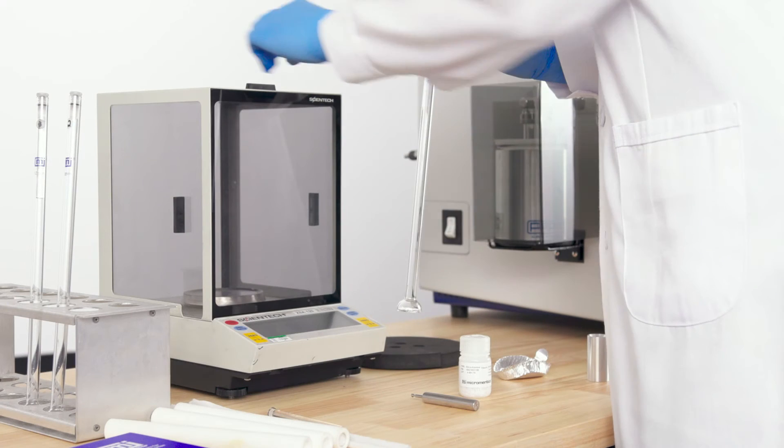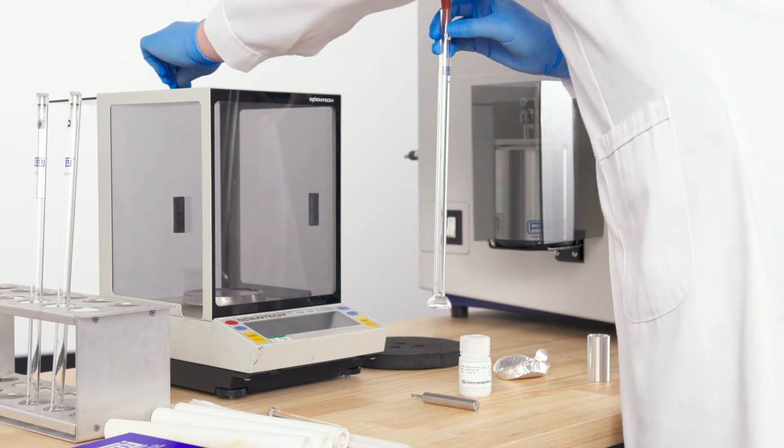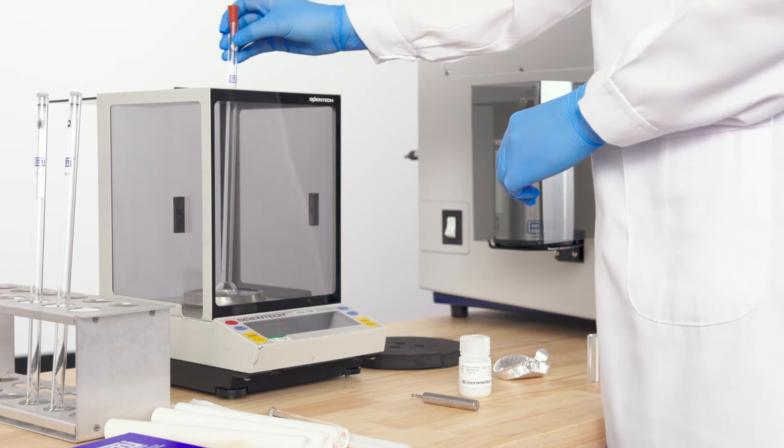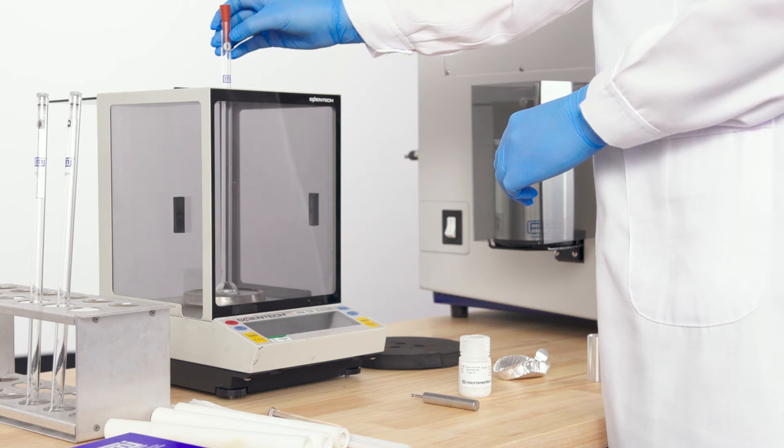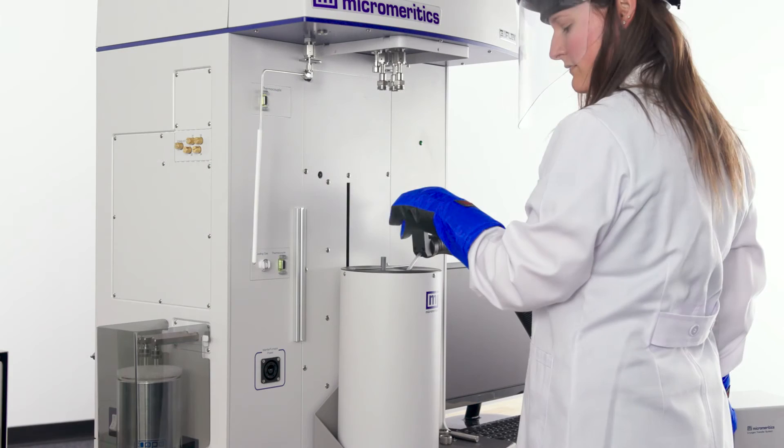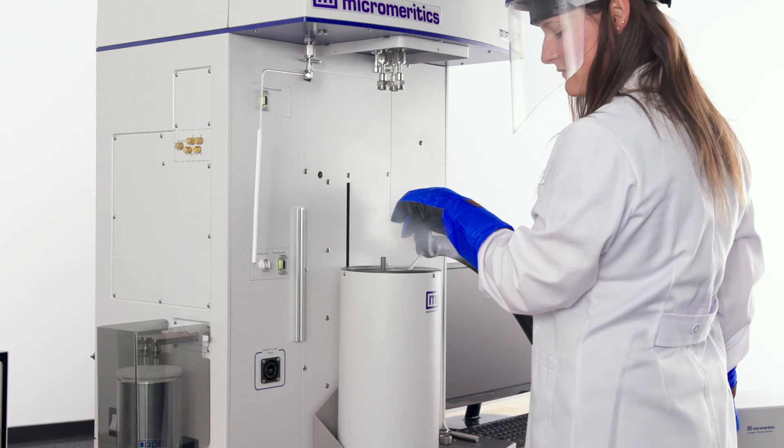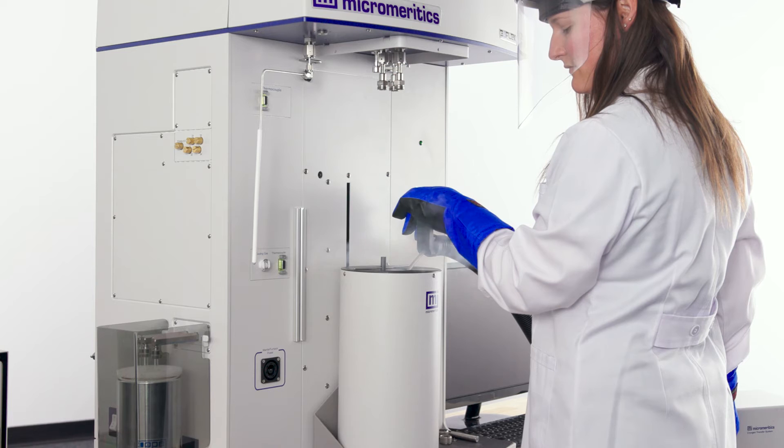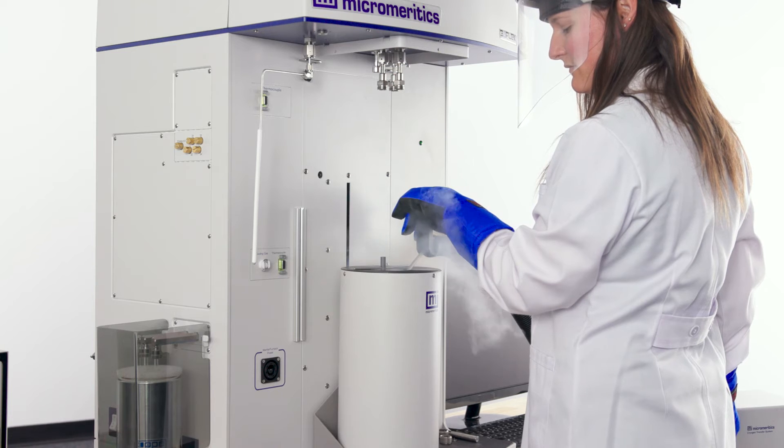Weigh the sample tube after degas is complete. Use the after degas mass for the report. Fill the dewar up with liquid nitrogen on the elevator appropriately.